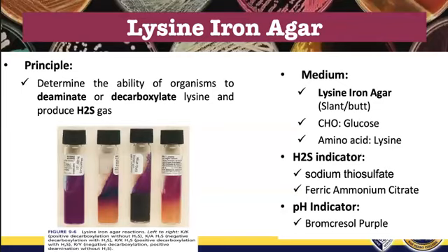So, we just cannot see it, okay? But that is usually the reaction. Unlike in TSI, recall, in TSI we also observed hydrogen sulfide production where the entire butt is covered, but it is still reported as acid butt, right?